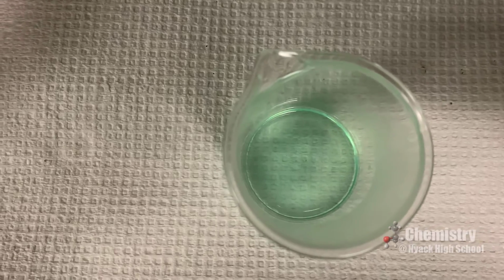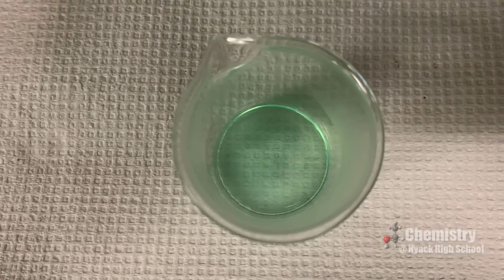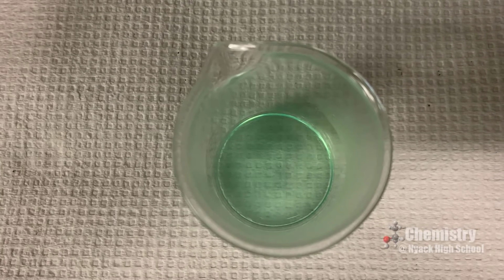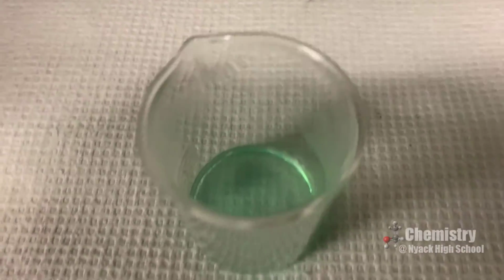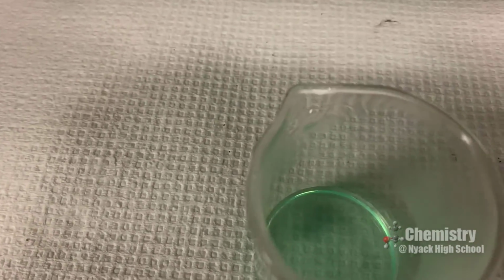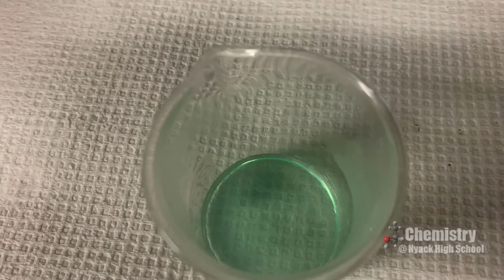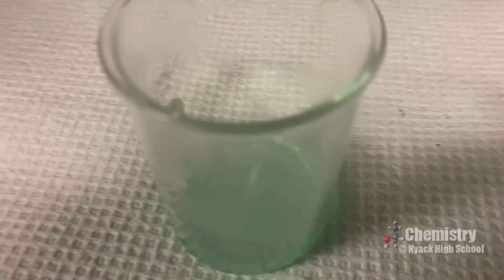The coin fragment is completely dissolved. There is no more nitrogen dioxide being evolved. At this point, I'm going to precipitate the silver as silver chloride by adding a solution of sodium chloride. I've carefully measured the amount of sodium chloride to be twice the amount that I need to precipitate the silver as silver chloride, just to ensure that I precipitate all of the silver ions.